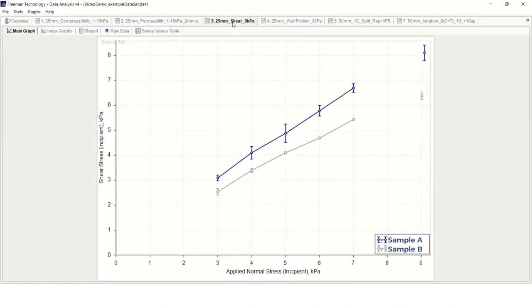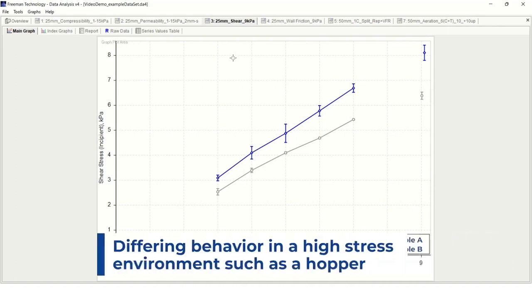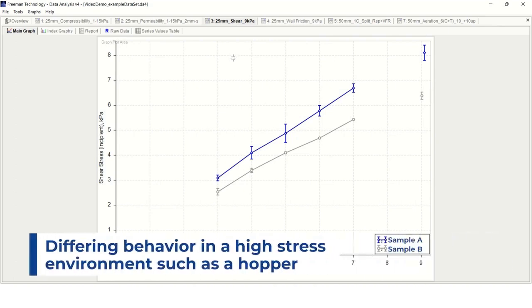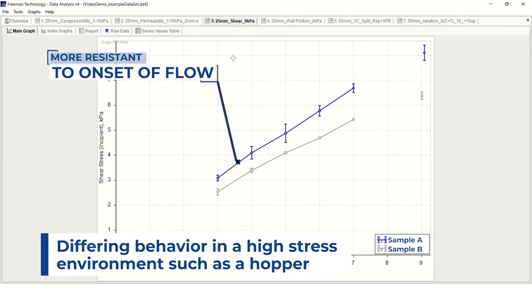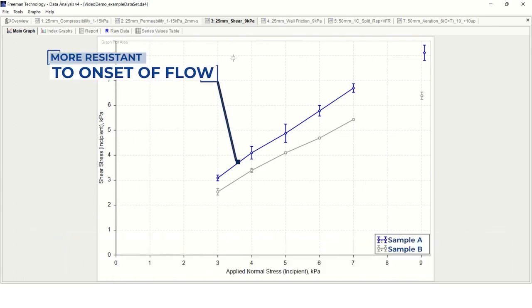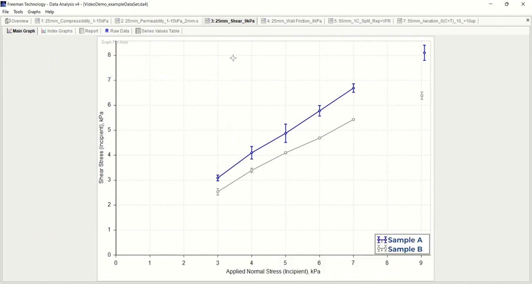Next, we can look at the shear properties of the powder in either a shear cell or a wall friction test. We can see here two different yield loci that were formed for the different samples. These differing trends indicate that the samples will exhibit differing behavior within a high-stress environment, such as in a hopper. The higher shear stress values generated for sample A suggest that this sample is more resistant to the onset of flow within a consolidated environment. These results are in agreement with the increased specific energy that was observed for this sample in dynamic testing.